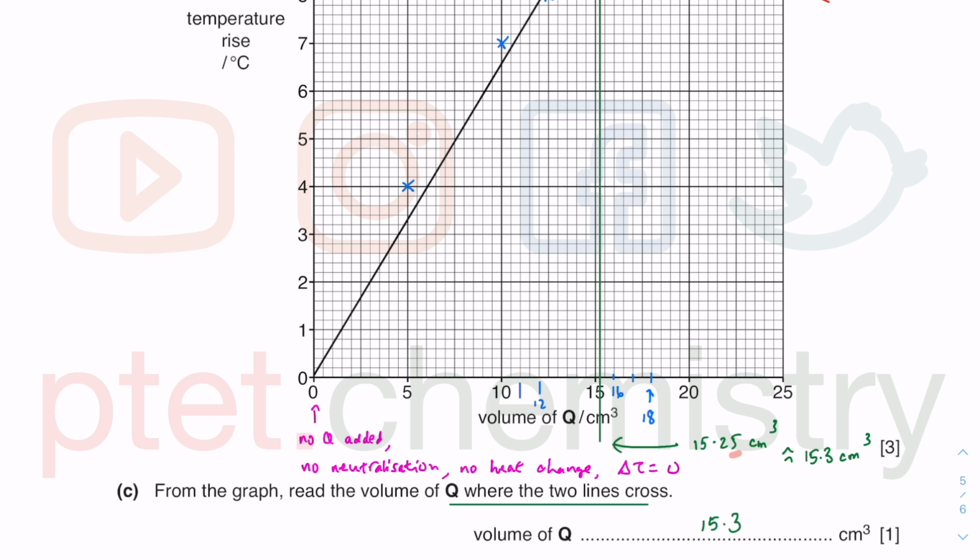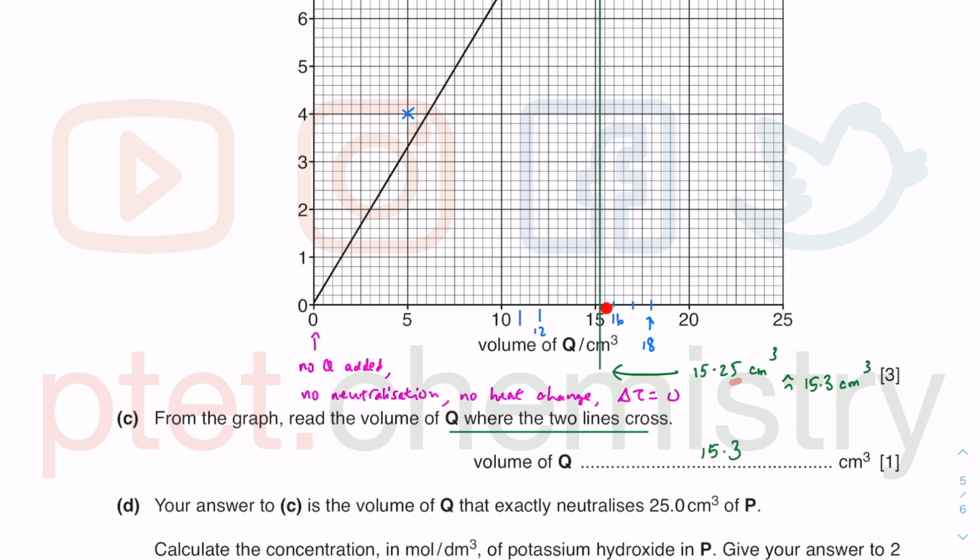As you know, about 1 decimal place burette reading in O-level, IGCSE level chemistry. Okay, so there's 15, there's 16, there's 15.5. This is in between, it's 15.25. Round it up, 15.3, 1 decimal place there.